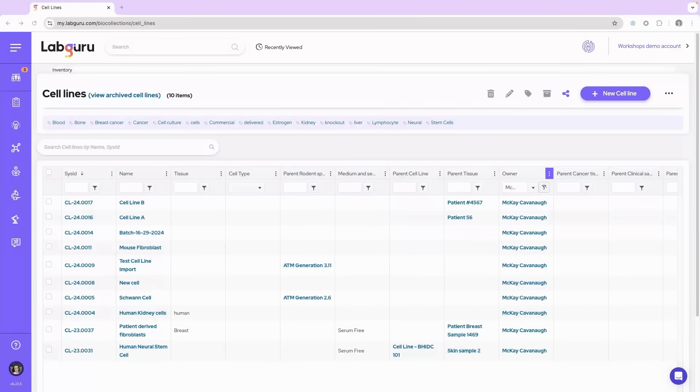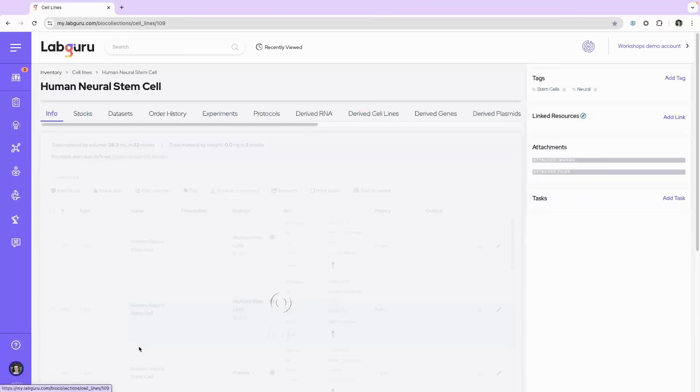Stock alerts can be set for inventory items. What you'll need to do is go to the collection and item that you're interested in setting the stock alert for.